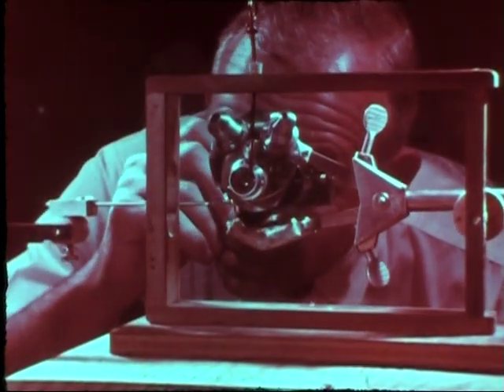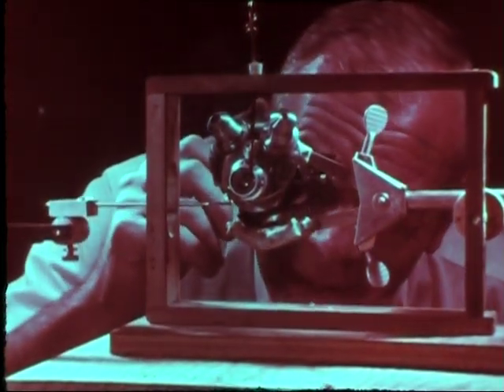When the plutonium sample was suspended from the balance arm, the bending of the quartz fiber was carefully measured. Using this measurement and having determined the weight of the cradle and the weighing pan, the exact weight of the plutonium was calculated.